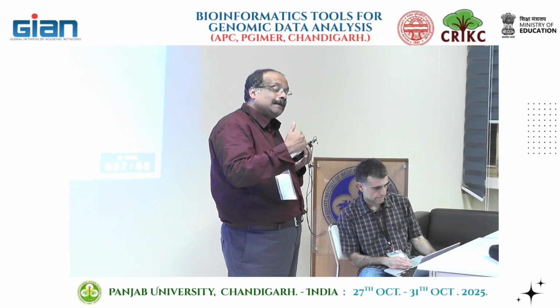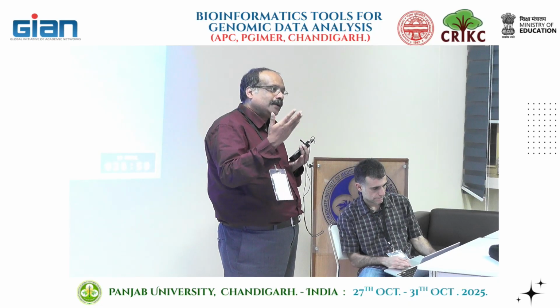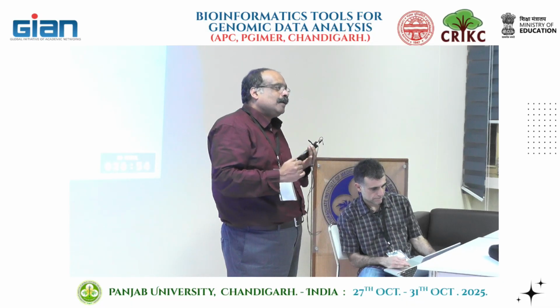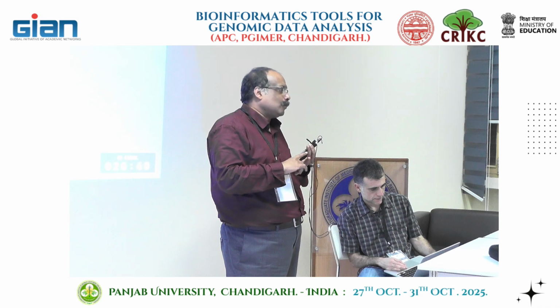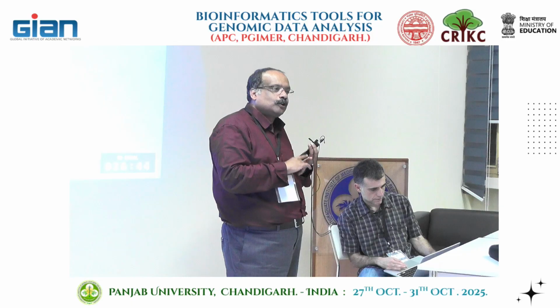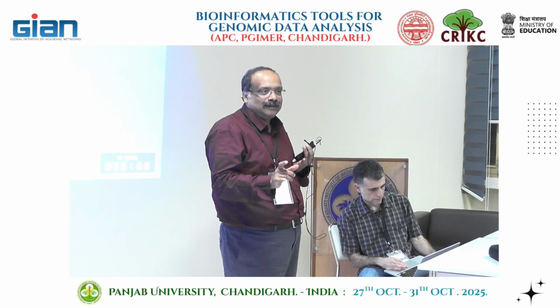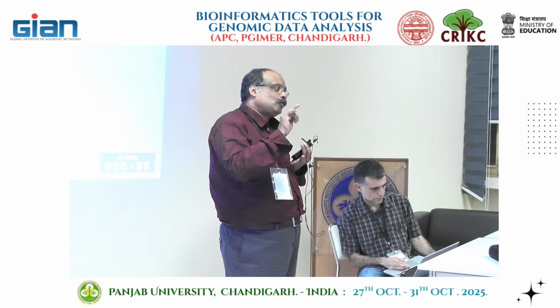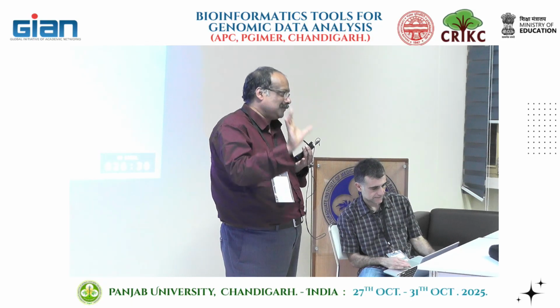And sometimes, if you are doing a functional analysis where the GO terms database is getting curated, and you do something one year after, you will see a completely different result. So be clear about your references, what reference genome you are using, which database you are using, and which version of software you are using, and properly put that in your methods section so that any result you are publishing is true under those circumstances.